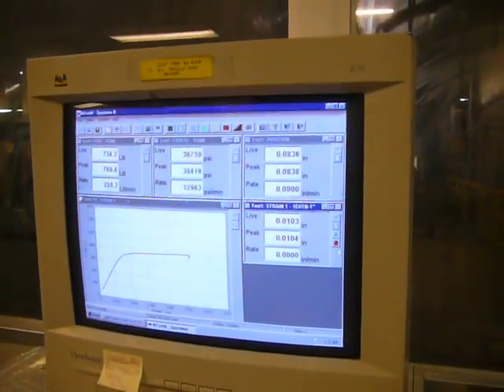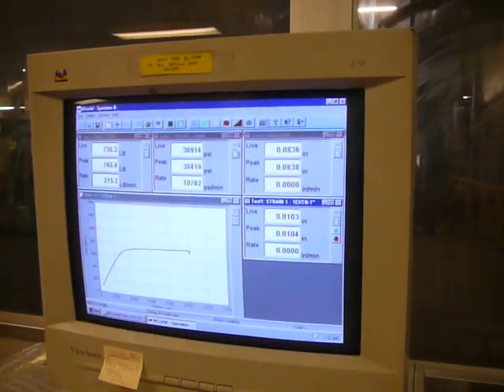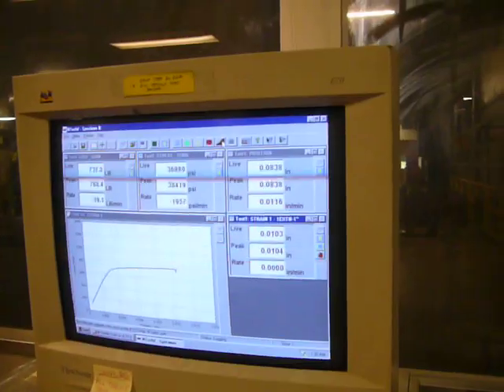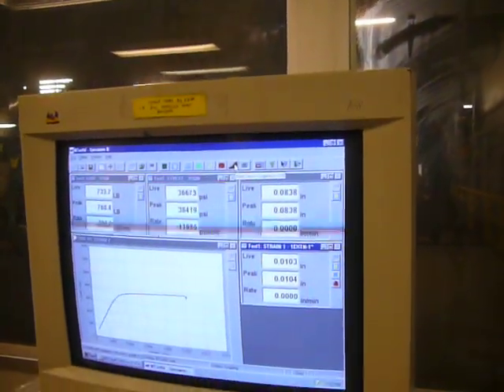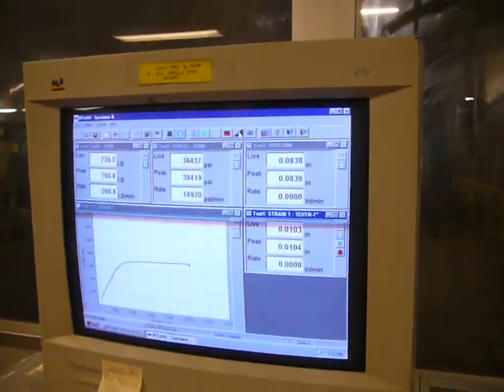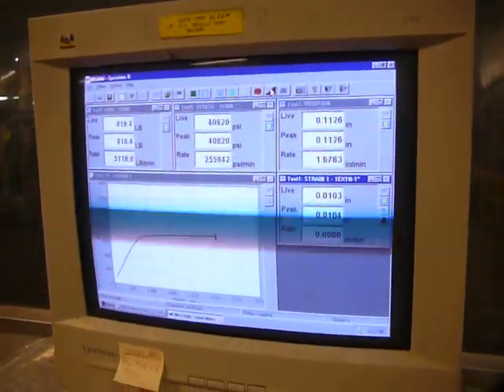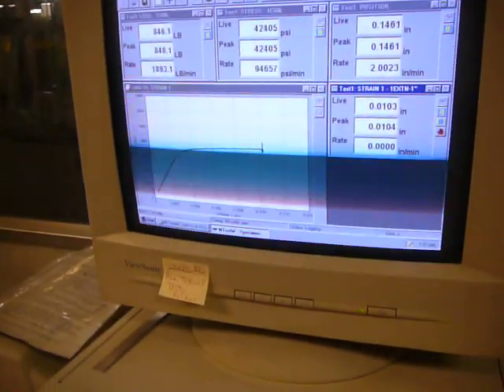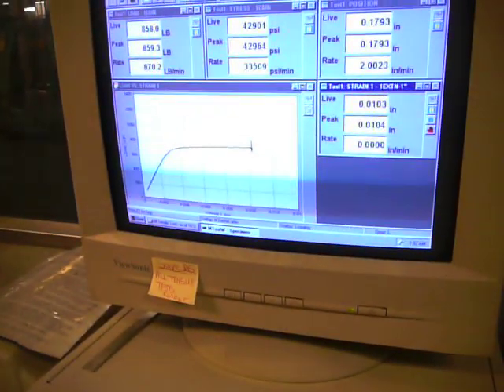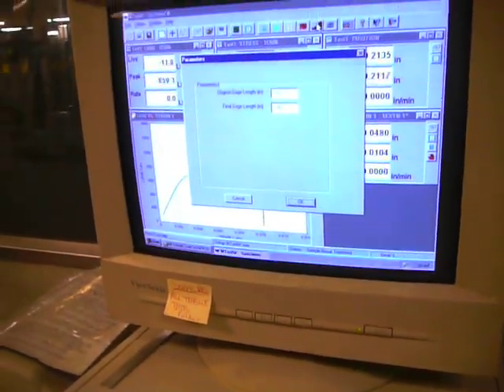And then, where's the stop button? And it'll break. Hold it. You can see it's broken. There's the upper half. Here is the lower half.